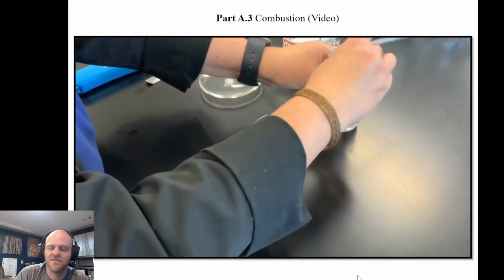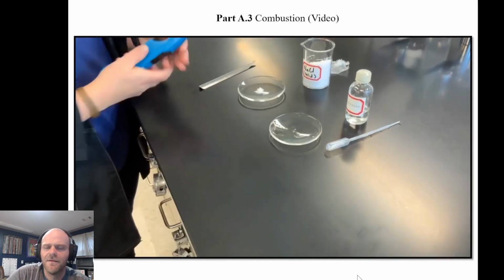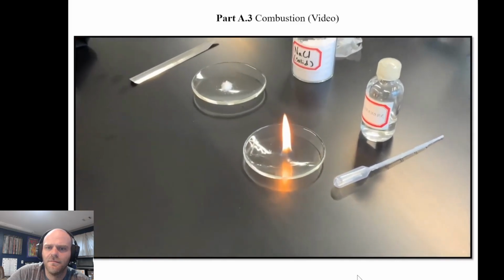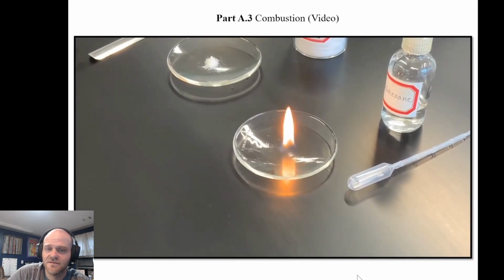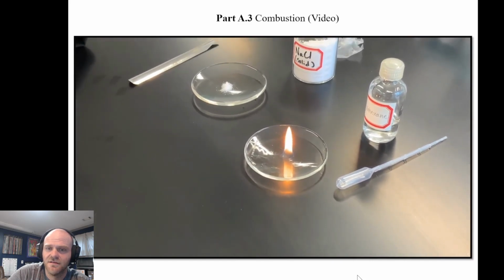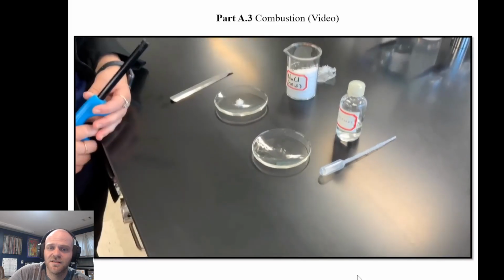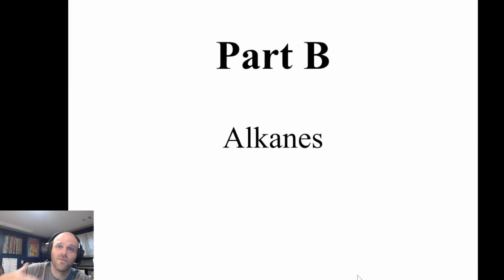So this is cyclohexane. And there you go, that's combustion. It generates its own energy, so it can keep burning until you're out of carbon atoms to combust.